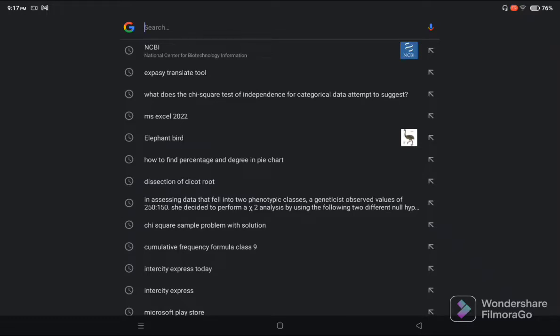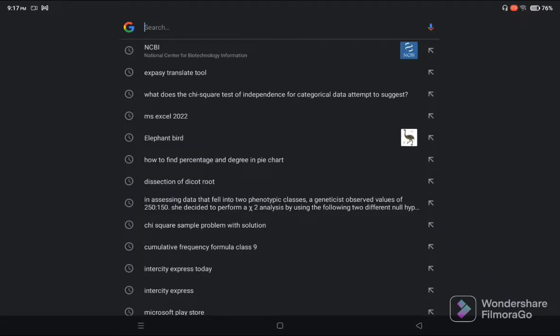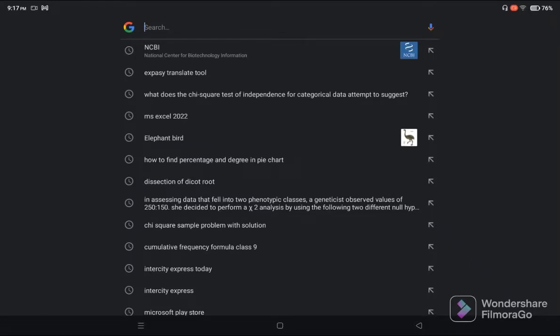The principle of today's experiment: the BLAST program, or Basic Local Alignment Search Tool, is one of the most popular programs for sequence analysis. Its objective is to find the high-scoring ungapped segments among relative sequences. The existence of such a segment above a given threshold indicates pairwise similarities beyond random chance.